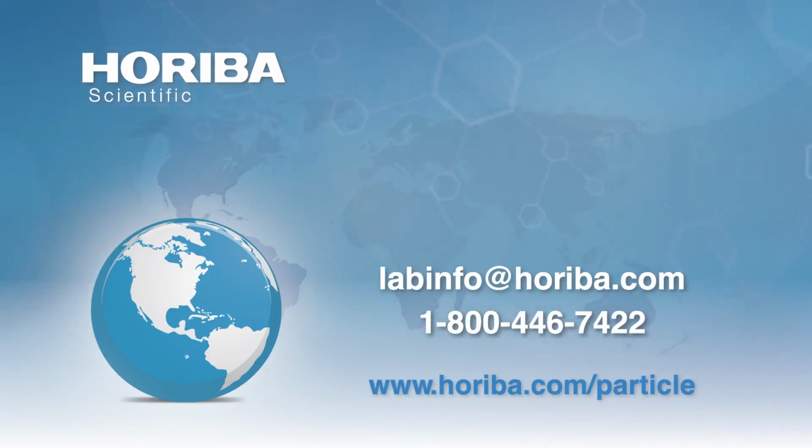And this is important to realize. In fact, I showed you the zeta potential of the glass sheet. And basically, that also becomes part of a formulation problem. Let's take a very simple example. Whether you store a suspension in a glass jar or you store it in Nalgene will make a difference to the shelf storage stability, because the zeta potential of the glass or the polymer inside will also impact how it interacts with the particles.